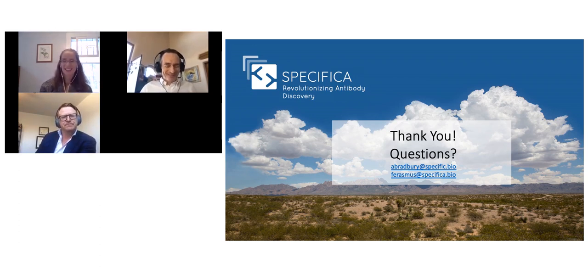Next question is, how do you address the artificial diversity introduced by the lower accuracy of PacBio sequencing? So this is a great question. We do several different steps. One, we set extremely high thresholds from PacBio, because you're absolutely right. And again, our underlying diversity is going to be from selection campaigns. You want to have a pretty good fold coverage of the underlying diversity that you anticipate. And so after that, we undergo 2 particular steps.